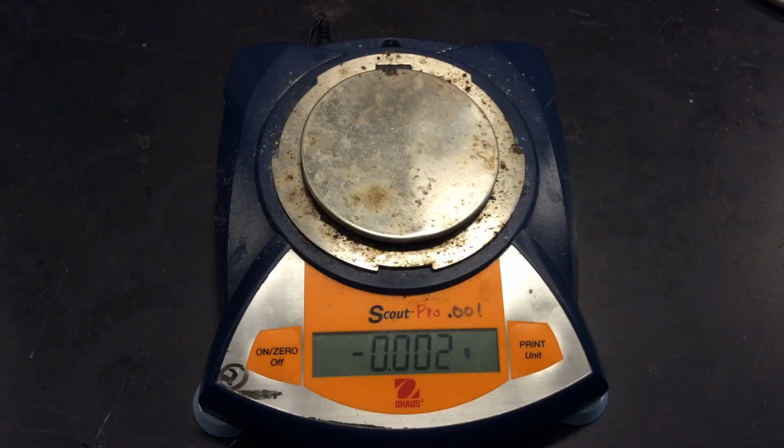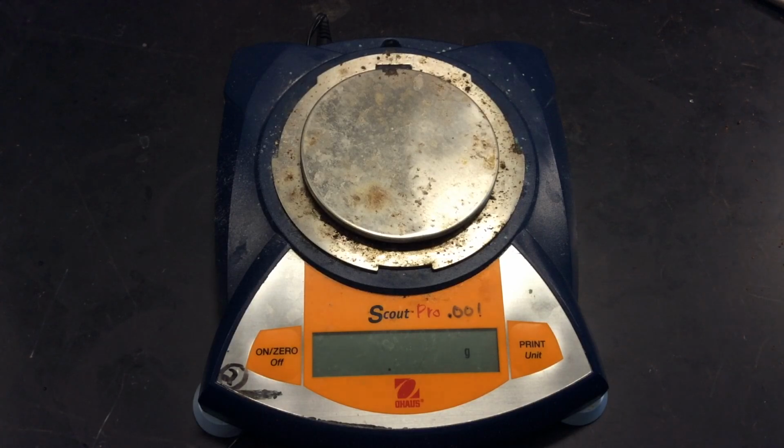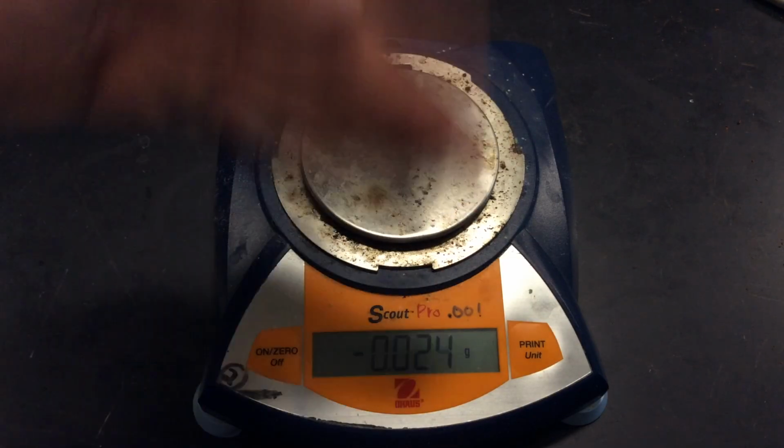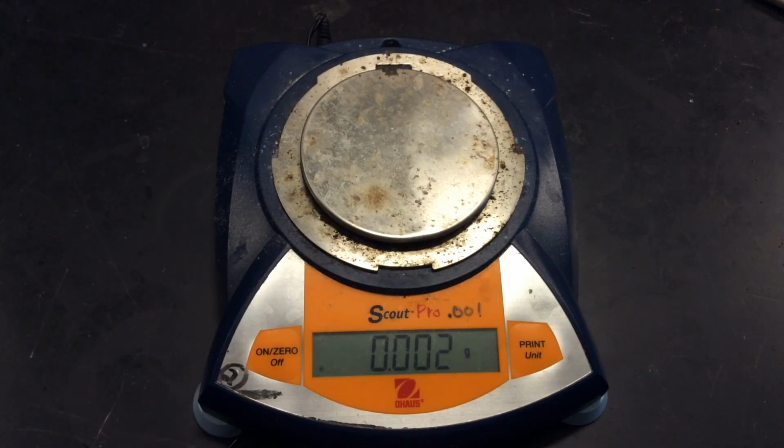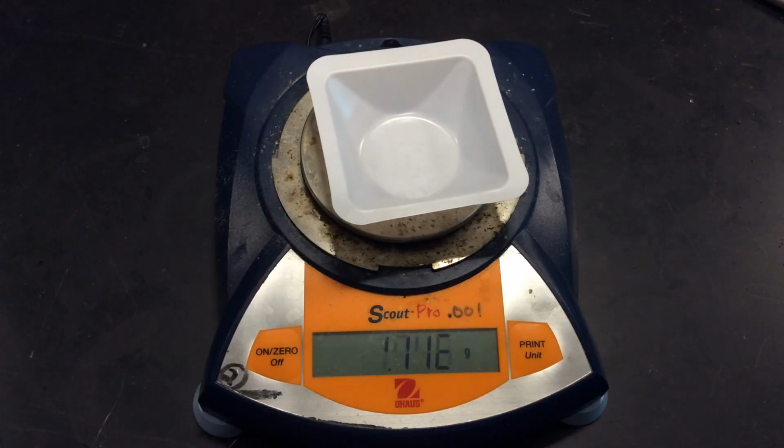Okay, so here's my electric balance, and I'm going to hit read 0. Now it may not go to actual 0 because it goes to 3 decimal places. Very precise instrument. It can pick up air currents. If I put my hand back and forth and make air currents, you can see I can make it go back and forth. So that's a very, very precise instrument. Okay, so now what I'm going to do is put a container on. Notice I just got the mass of the container.